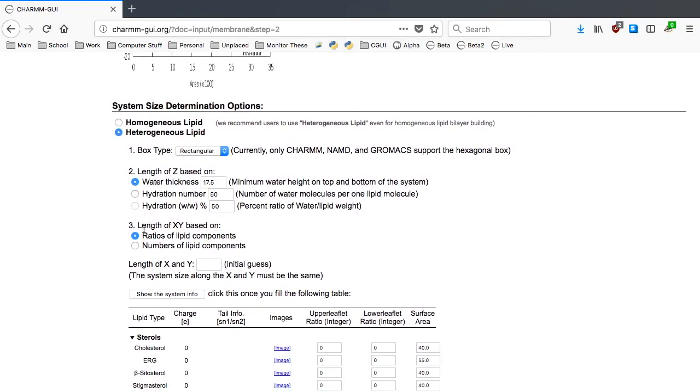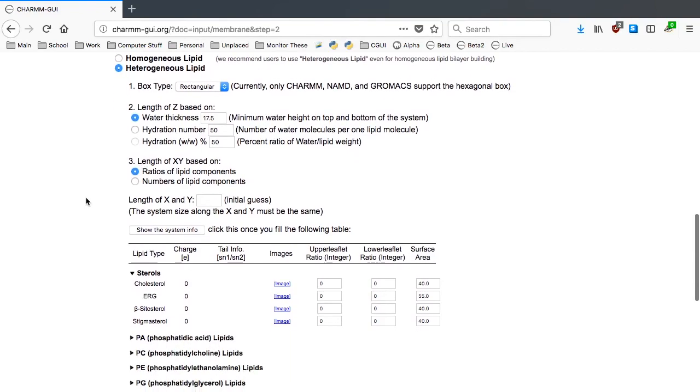The third is the most important option to determine the membrane dimension along the XY plane. The basic idea is to use the lipid area of each lipid to determine the XY dimension, so we need to know an approximate X and Y length to use a lipid component ratio.